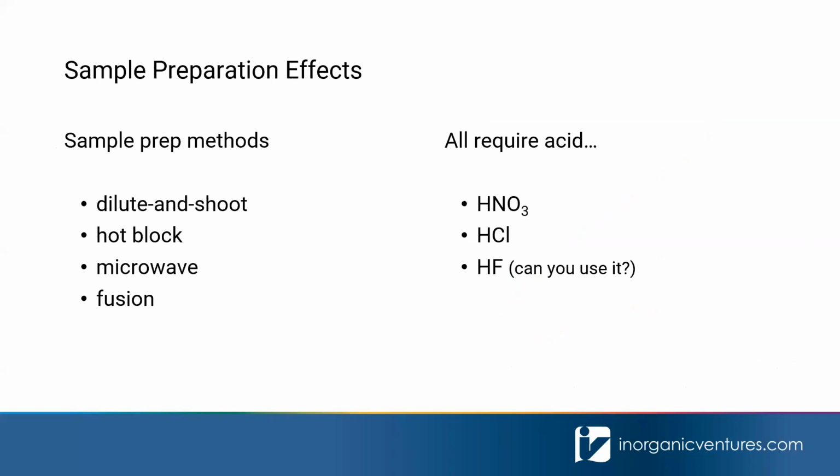From my perspective, I would say that these are essentially the same approach. They may be under pressure, they may not, but essentially you're taking your sample, you're adding some strong mineral acids and some energy, and you get everything into solution as you desire. And then the last one would be a fusion. It doesn't seem that a lot of people are using fusions extensively anymore, but if you are in your lab or you have any questions, we have a great deal of information regarding fusion sample preparation methods, and we could help you troubleshoot a number of different things.